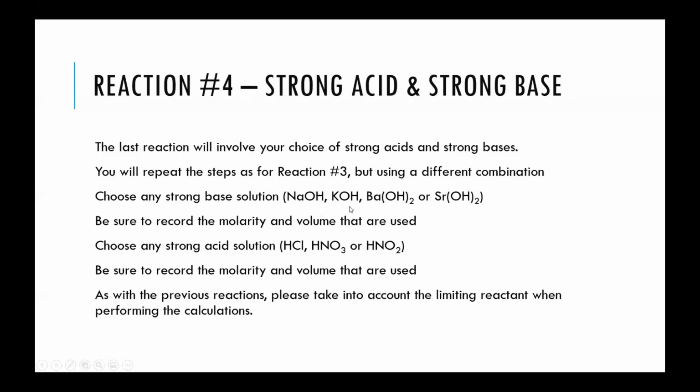These are the strong bases that are available in the simulation, and these are the strong acids available. You've already looked at the combination of sodium hydroxide and hydrochloric acid. So you need to choose any other combination of a hydroxide strong base and a strong acid, and look to see what is the molar enthalpy of that reaction as well.